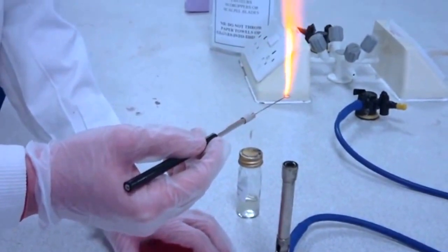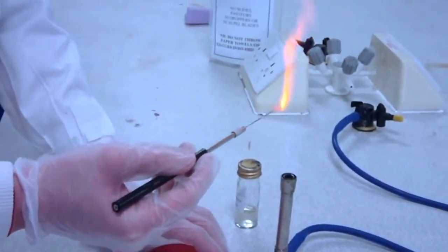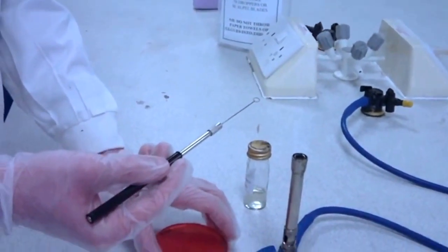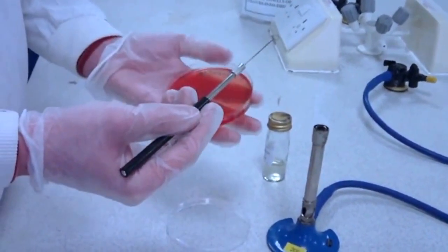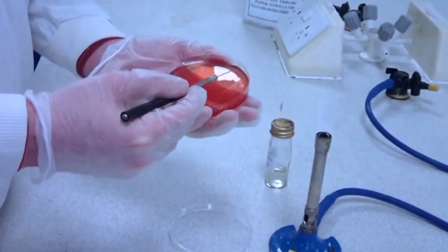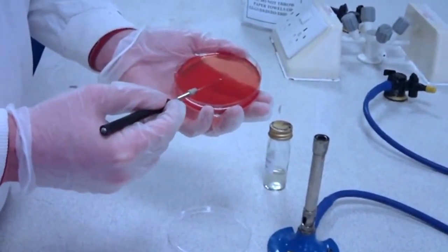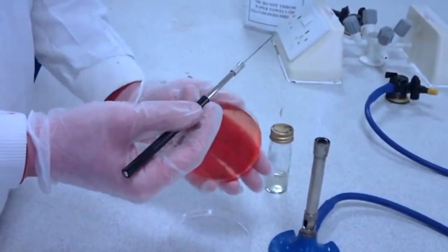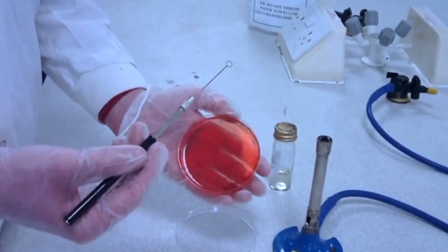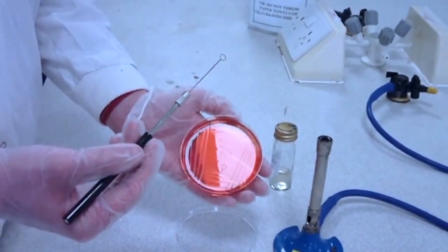Reflame the loop and allow to cool. And then in the final quarter of the agar, you need to streak the bacterium in a zig-zag formation from the outside of the agar towards the centre, making sure to not touch where you have previously streaked as this will not give the desired separation.